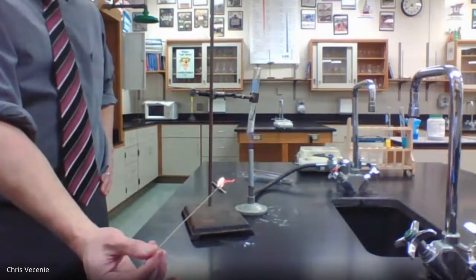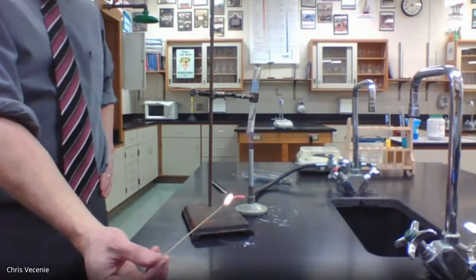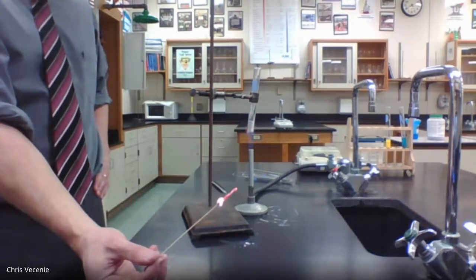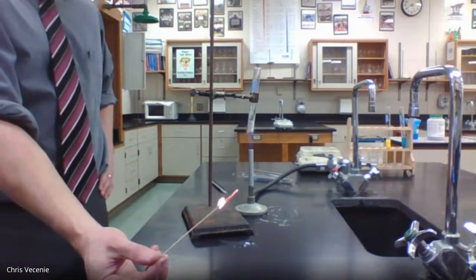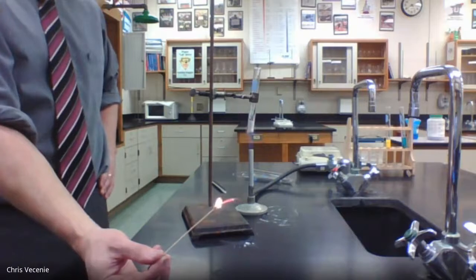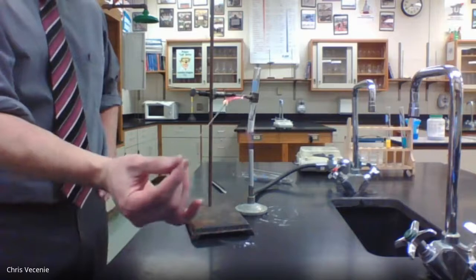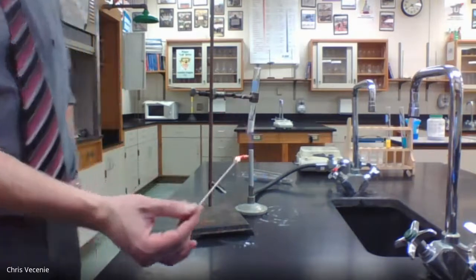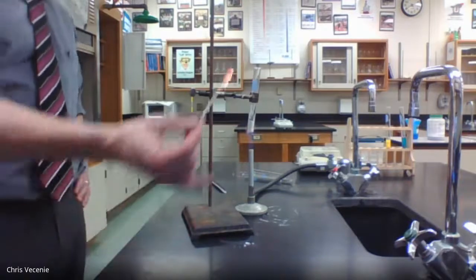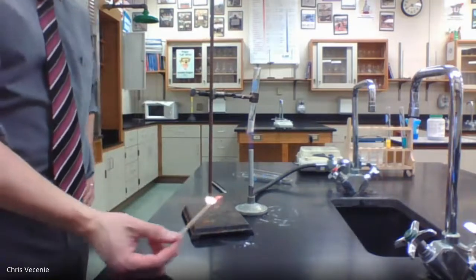he's just going to keep burning, because it has the two things that a combustion would need to keep burning. I've got a hydrocarbon, which is the wooden stick fiber, a lot of carbons, a lot of hydrogens in that. And there's a lot of oxygen in the air around us. Hence, this continues to burn. So what I'm going to do is light that splint and let it be on fire, and I'm going to hold it down inside of our test tube when the time comes.